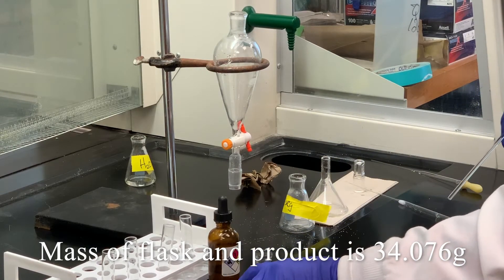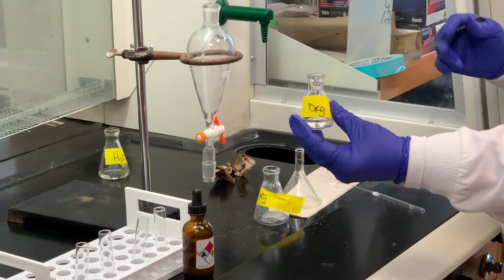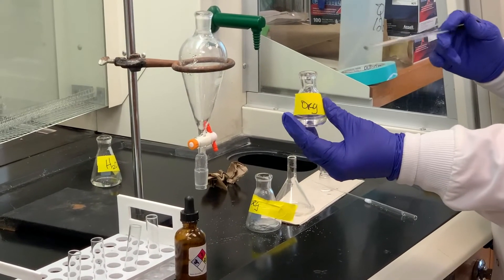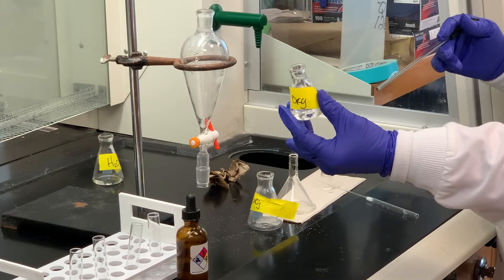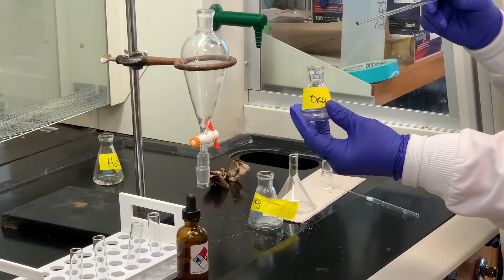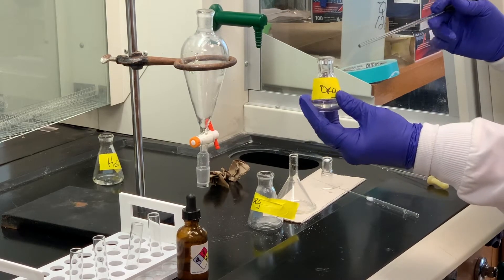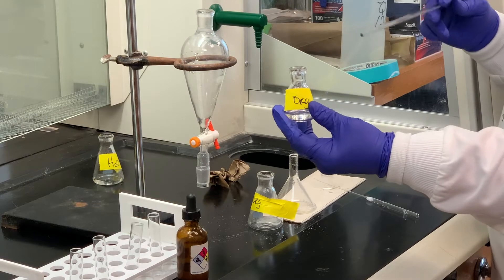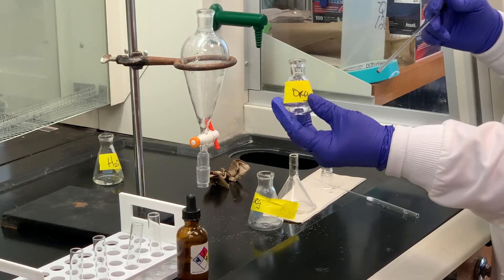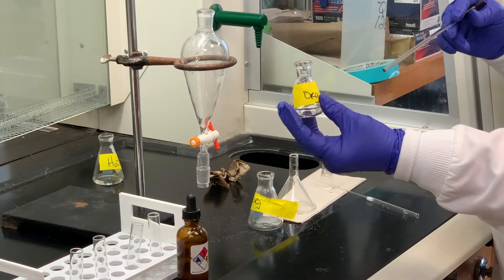Ideally, what would be great is to distill this — do a simple distillation to make sure that we isolated pure product. We have such a small amount that I'm a little skeptical of going through that simple distillation. I don't think we will get very much; a lot will still be trapped within the condenser and even in the still pot. So we're going to omit the simple distillation.